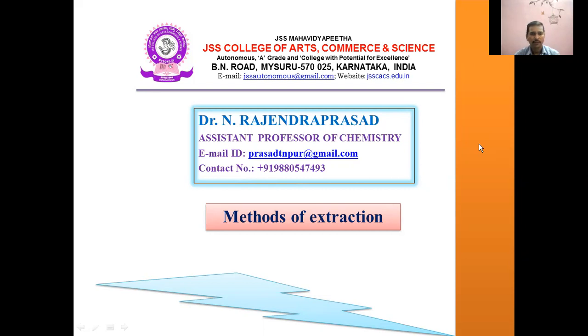And if the solvents yield very high extraction efficiency, how many extractions do we have to perform? Is it possible to perform the extraction with an efficiency of 99% by doing only one extraction, or by doing multiple extractions? All these things come into the picture in order to decide what extraction method we have to use. So let us discuss in detail the different types of extraction methods we employ in the liquid extraction process.